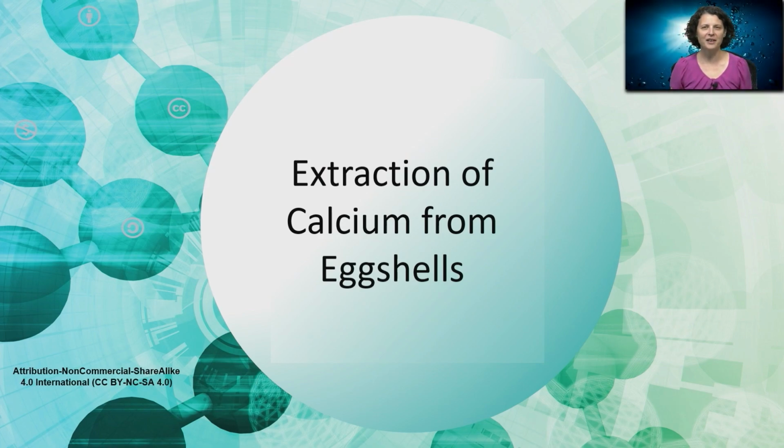My name is Dr. Esther Trufan, and in this video, we're going to explore the extraction of calcium from eggshells. There are two steps to this process.